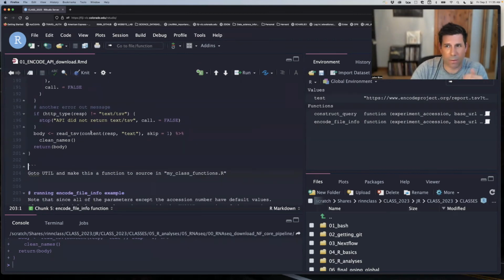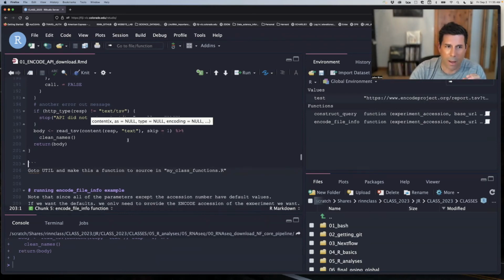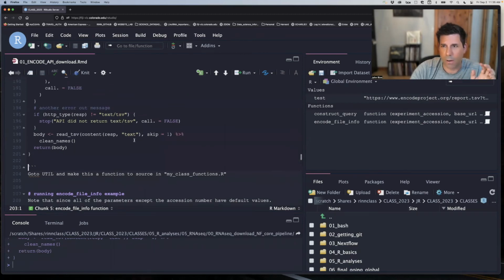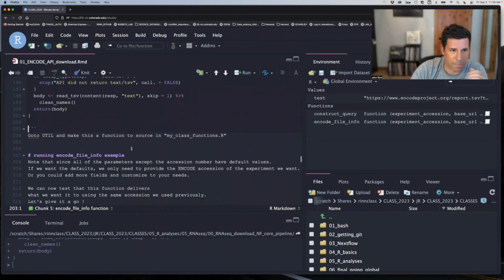So this is really important that we're saying exactly where we went, what information we had, and then when we do analyses, we can use that core reproducible sample information and take out the columns we want to do our analyses with and clean them up. And that's what we're going to do in the next class: make a sample sheet for our RNA-seq analyses from the information we retrieve here.